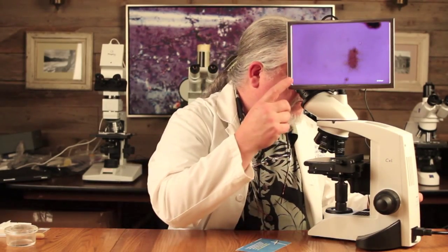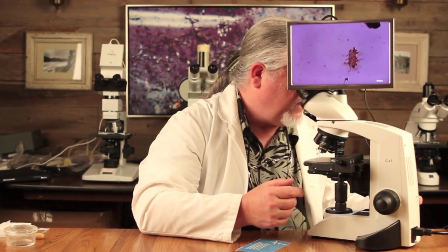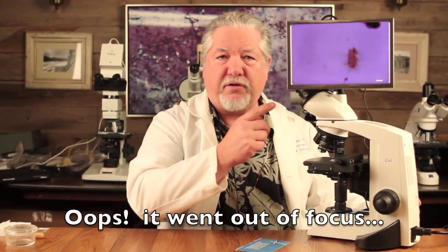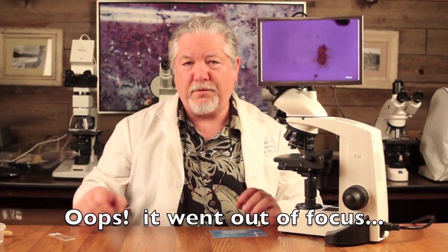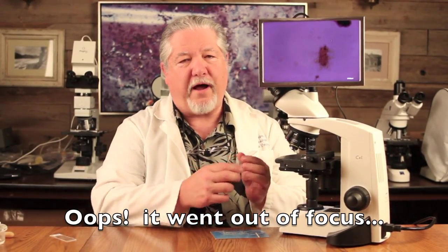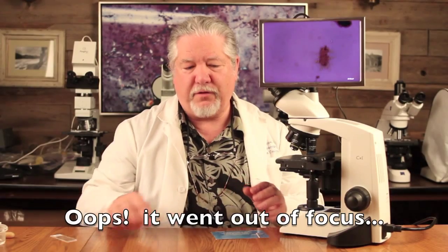We're going to show you how to find some of these cells. I have a microscope here with a fancy monitor, and if you see on the monitor, you'll see a cell — that's actually a dinosaur bone cell collected from this Triceratops horn. We hope to teach you how to make microscope slides with dinosaur cells on them, like the one you see here.